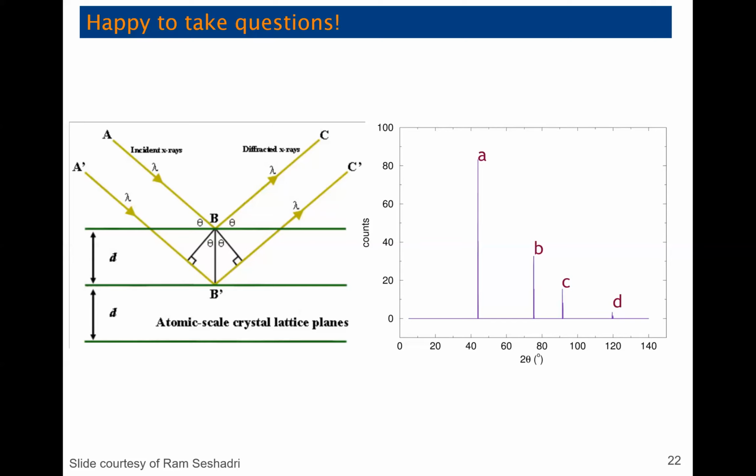A lot of the time I used to do ex situ experiments where you discharge the battery to different amounts. So you're either stuffing in lithium to different amounts, or pulling it out to different amounts. You can control that by what voltage you discharge to. Then you open up the battery again, take that material out, put it in a tube and send it to the synchrotron. But it takes a while to get that data. Who knows? Maybe your material was air exposed. You don't figure it out until 6 weeks later, and then you have to redo the experiment, and you're behind. So what Elias is talking about is, can we actually look at the structure of the material while it's still in the battery? That's something we're working on.